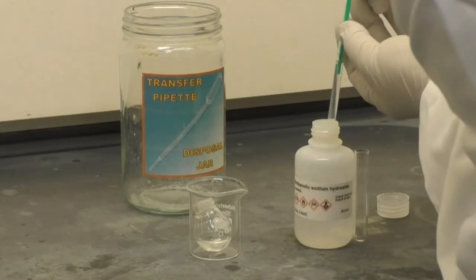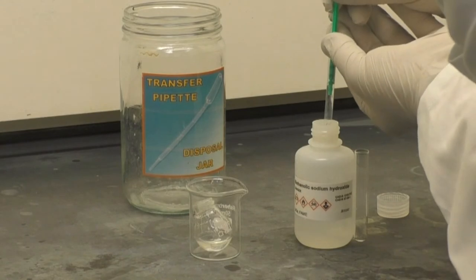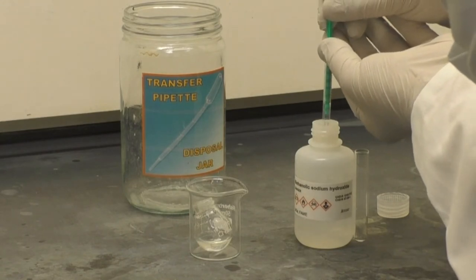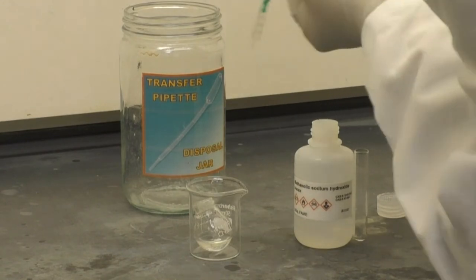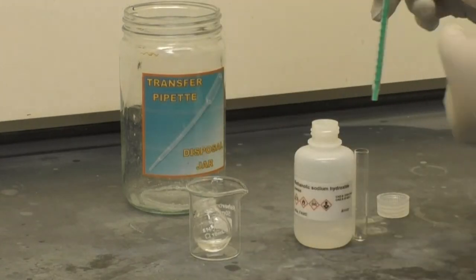Using a 1 ml syringe, add 0.5 ml of 0.5 molar sodium hydroxide methanol solution.